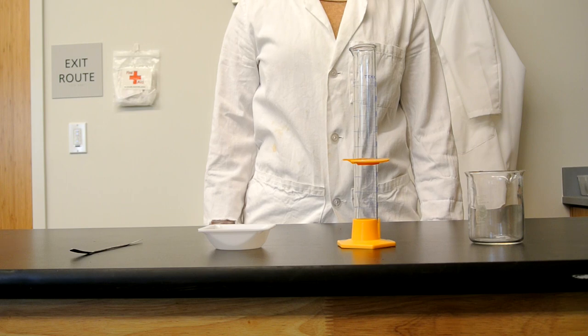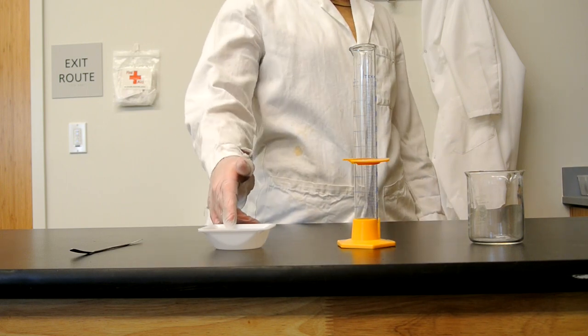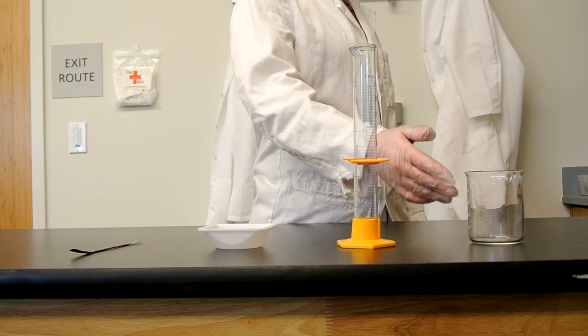You need different equipment for measuring solids and liquids. For solids, you'll need a spatula and some weigh boats. For liquids, a graduated cylinder and a beaker.